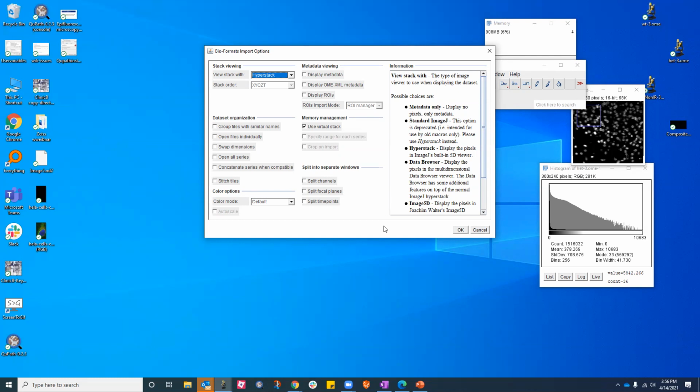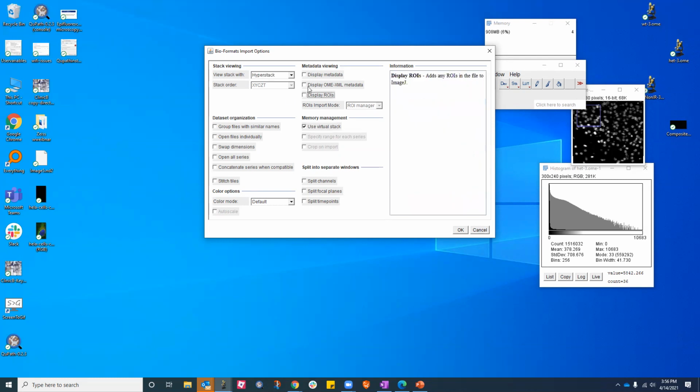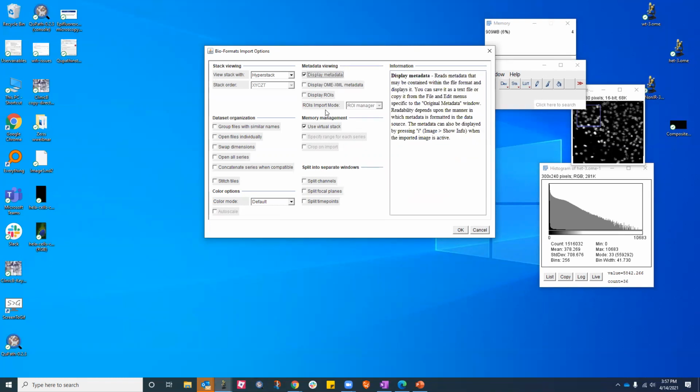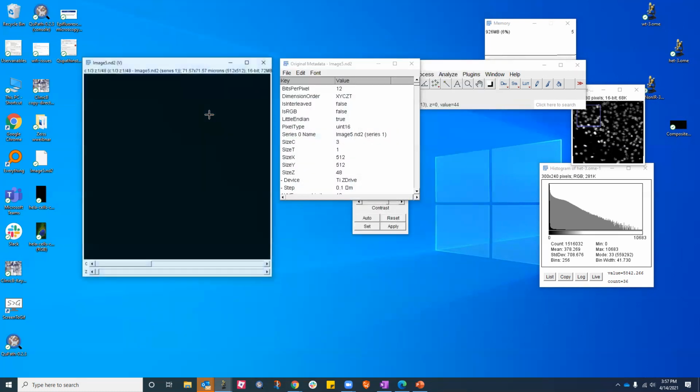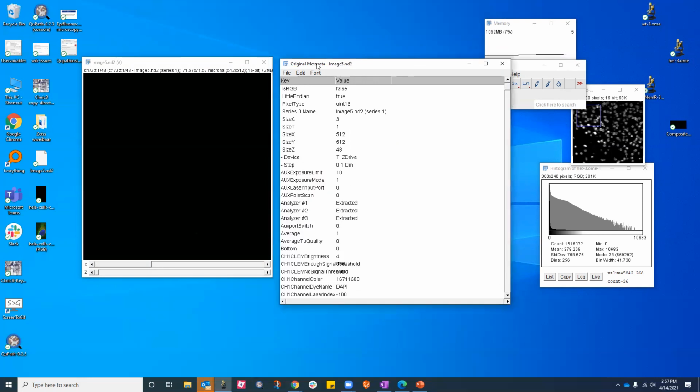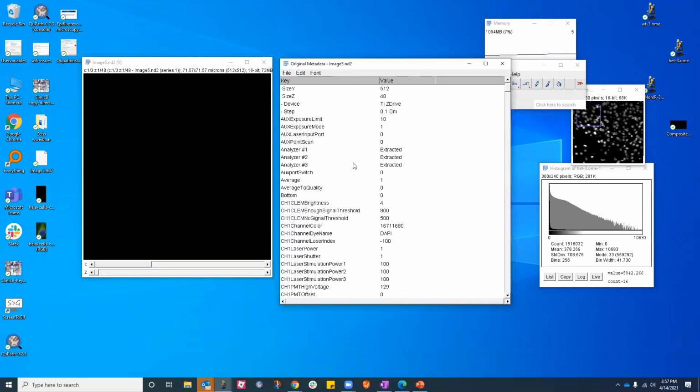The other thing that you can also do with the ND2 files is look at the metadata, okay, which comes associated with the file, which tells you what kind of objective I used, what was my laser power, what was my high voltage values, and so on. If it's a camera-based system, it will have information on the percent of light which is passing through, will have information on the exposure of the camera, and so on. So let's display the metadata. All right, so here's what it's telling me completely. There are a lot of values, right?